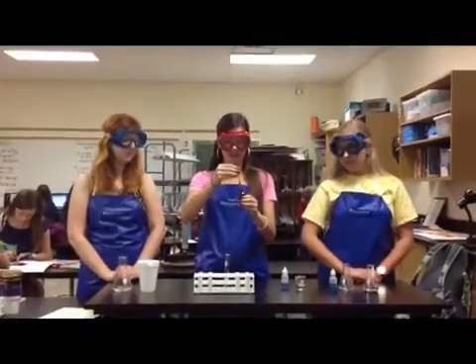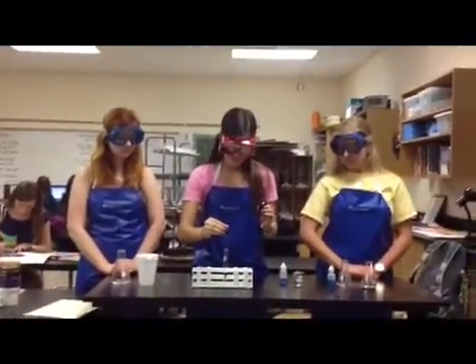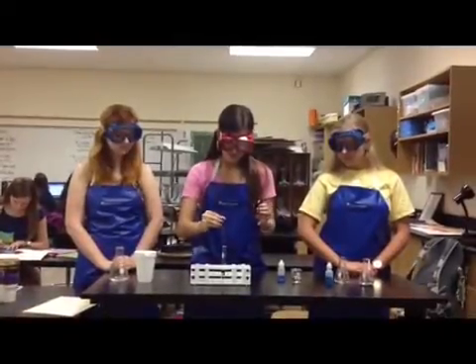For this experiment we have a mystery solution and it could be a combination of any of the three macromolecules. First we're going to test for starch using the iodine — we're going to put five drops in. And then we're going to wait for two minutes. So it's been two minutes and you can tell it's a purple color, so there was a positive reaction for starch. We have to be sure to clean out our test tube so we do not cross-contaminate.